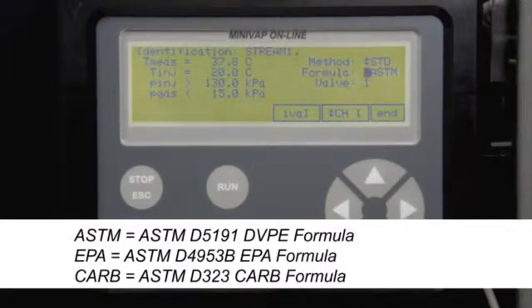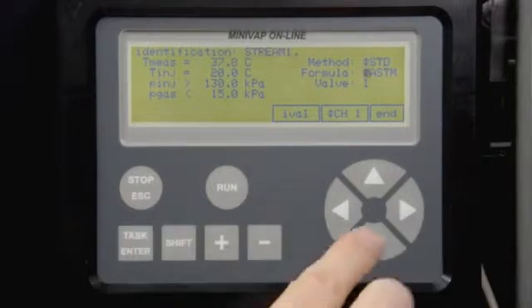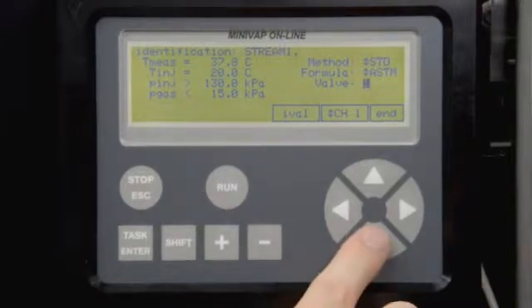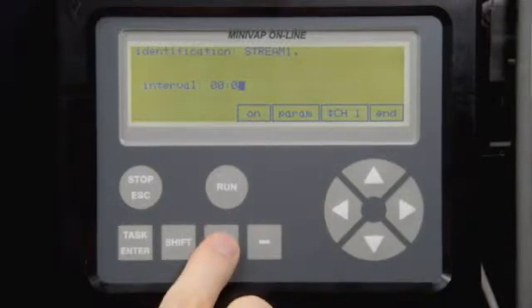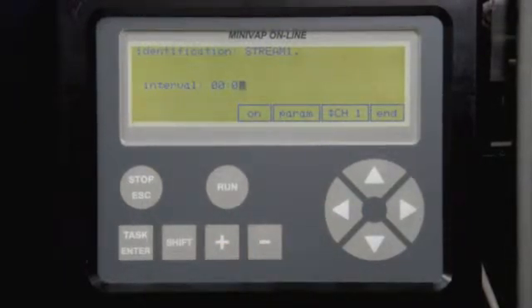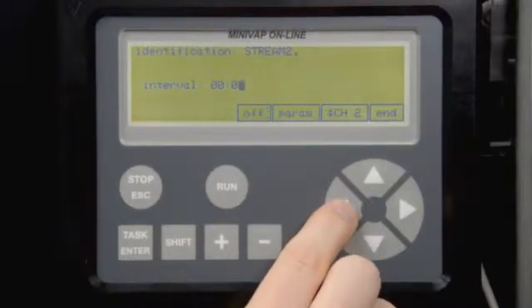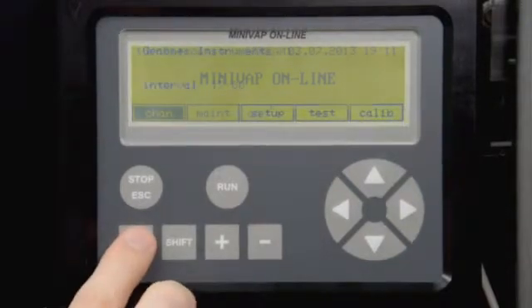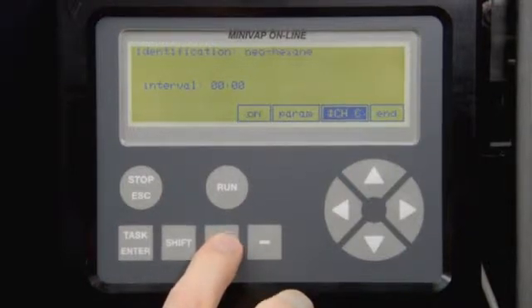CARB is the D323 gasoline correlation formula used by the California Air Resource Board. Next, select the valve you want to use for this channel. Select IVAL to define the measuring interval. For a standard gasoline measurement, a 7-minute interval is required. For a V over L test, a 10-minute interval. After you've programmed the measuring channels, move to channel C, used for calibration and validation.